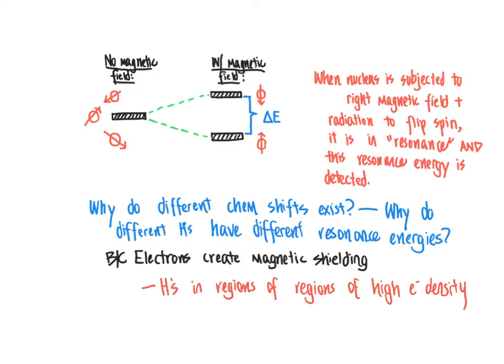So protons in regions of high electron density experience a weaker magnetic field than what the external field is.